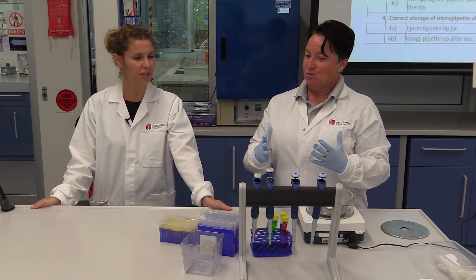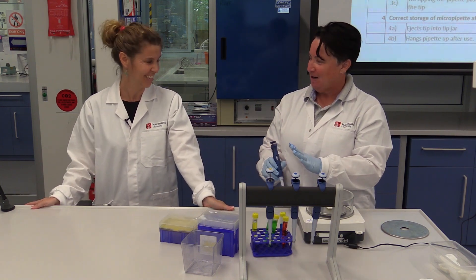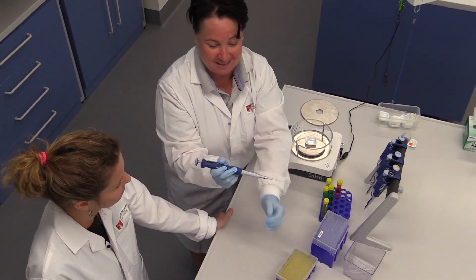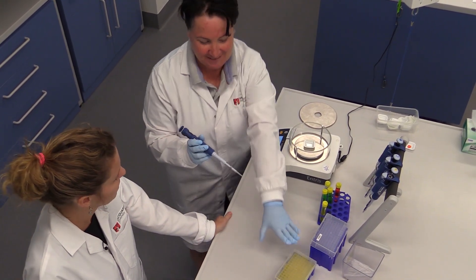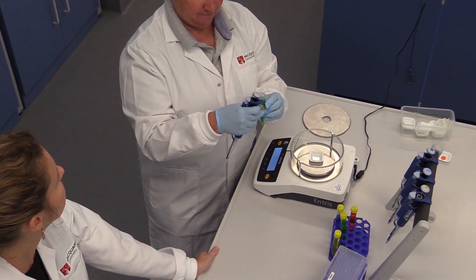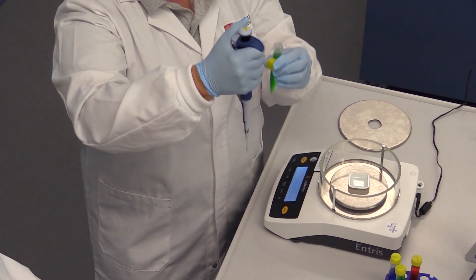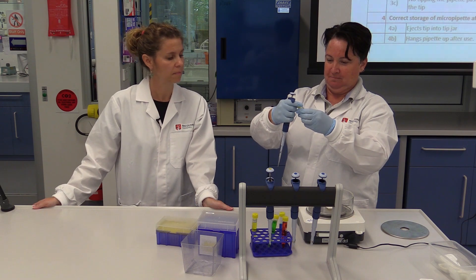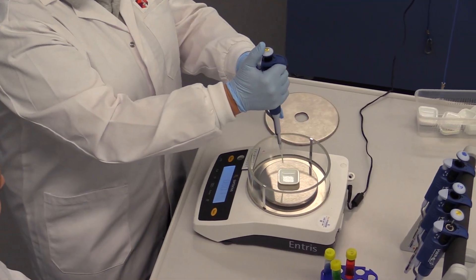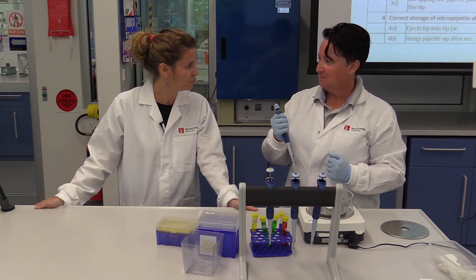Okay. 22 — 22 microlitres. This pipette, 10 to 100. Yeah, yellow tip. Exactly — or it's actually white here, but it's in the yellow box. Upright position. Upright. Solution. Upright. Slowly. Okay. Perfect. Your balance is ready. Dispense. Oh. Pretty good.